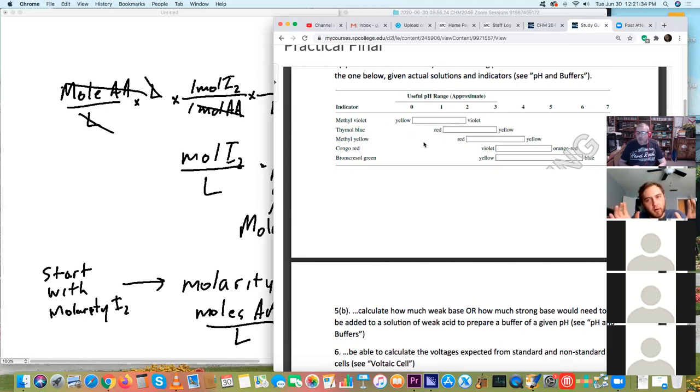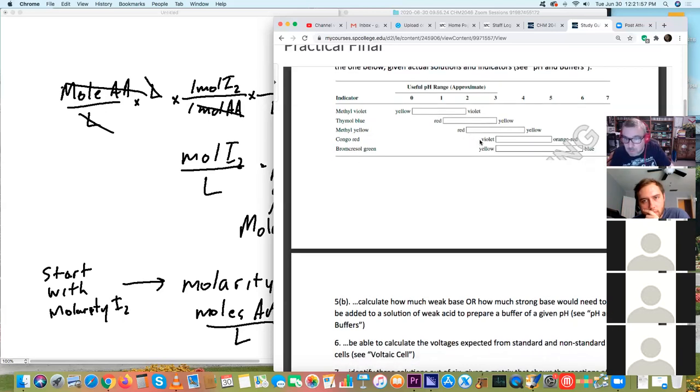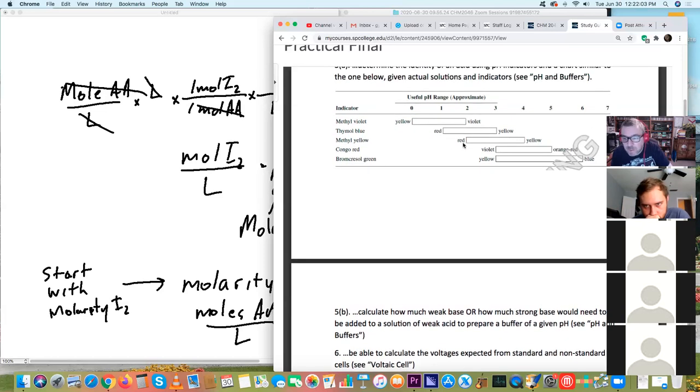So with that being said, the initial color of just those two is the initial start from the 10 mystery dropper, and then we just see what else reacts with it. I suppose there is a bit of similarity here, but for something like this, we're only interested in the end color for this specific question that I'm looking at here. We're only interested in the end color, not the beginning color. Okay? That's a difference.